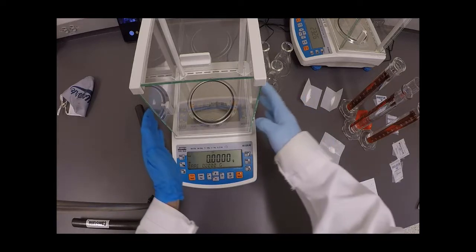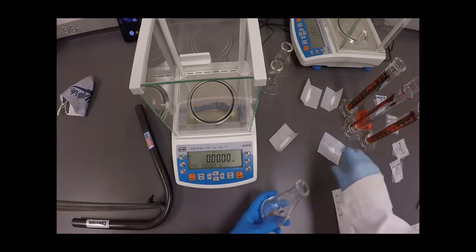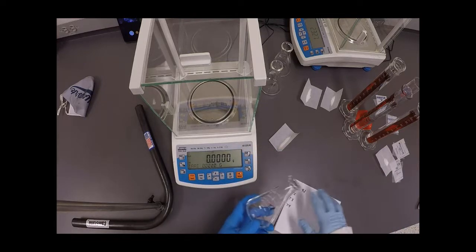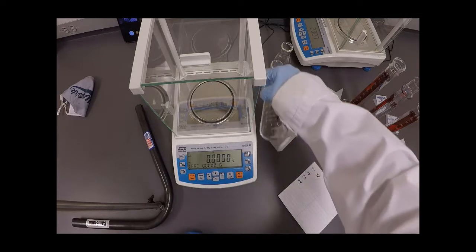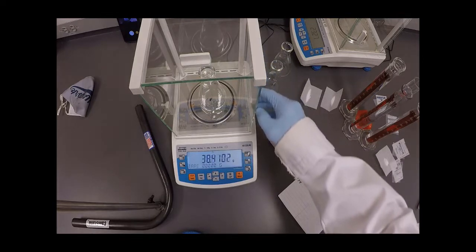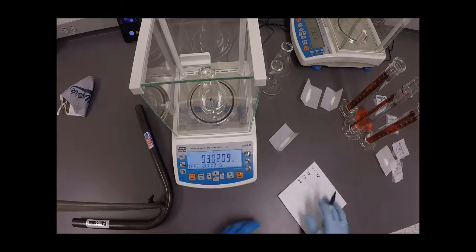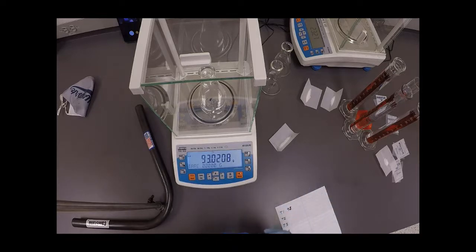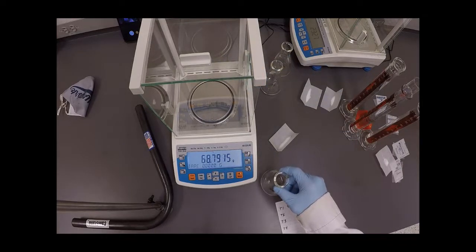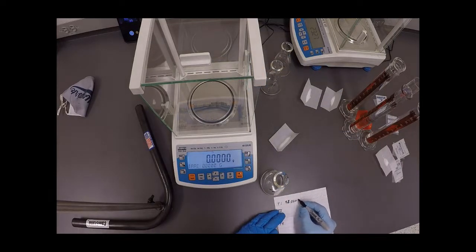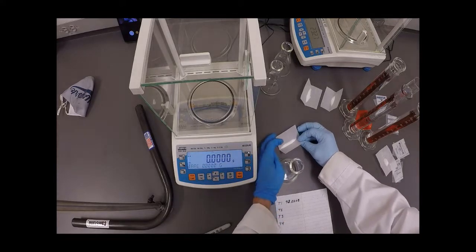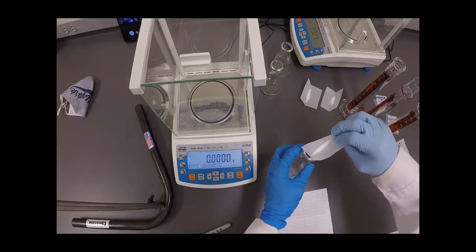Now I'm going to go ahead and begin by, I've got three trials available here, three Erlenmeyers, which I've labeled already, and I've got a little note sheet here. So I'm going to open up my balance door and carefully take the mass of the first Erlenmeyer, 93.0208. So 93.0208 grams.